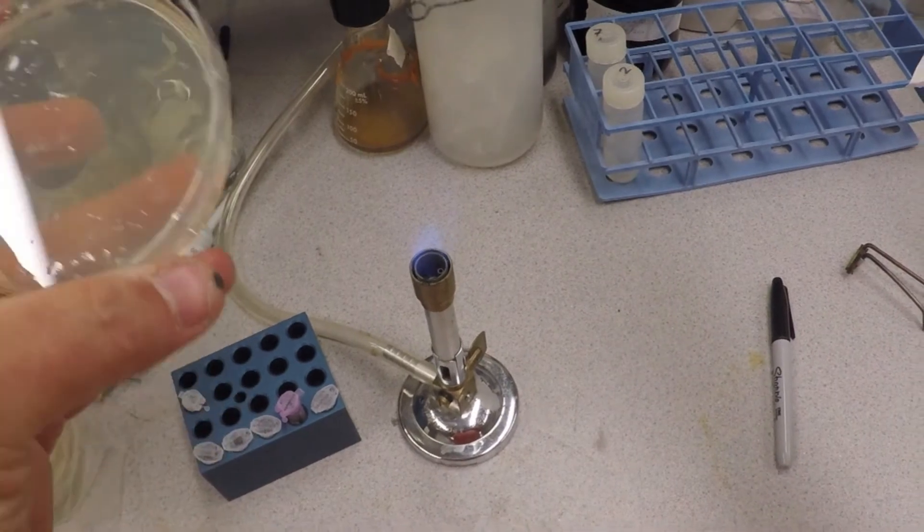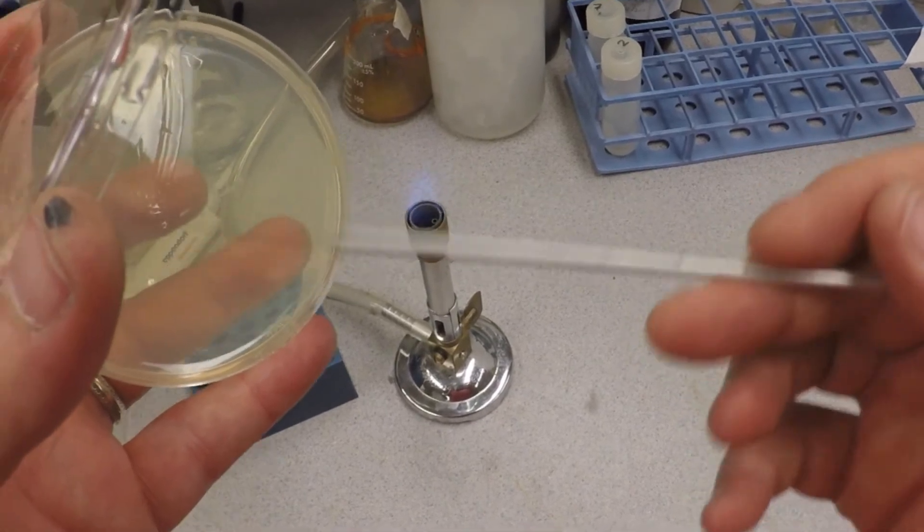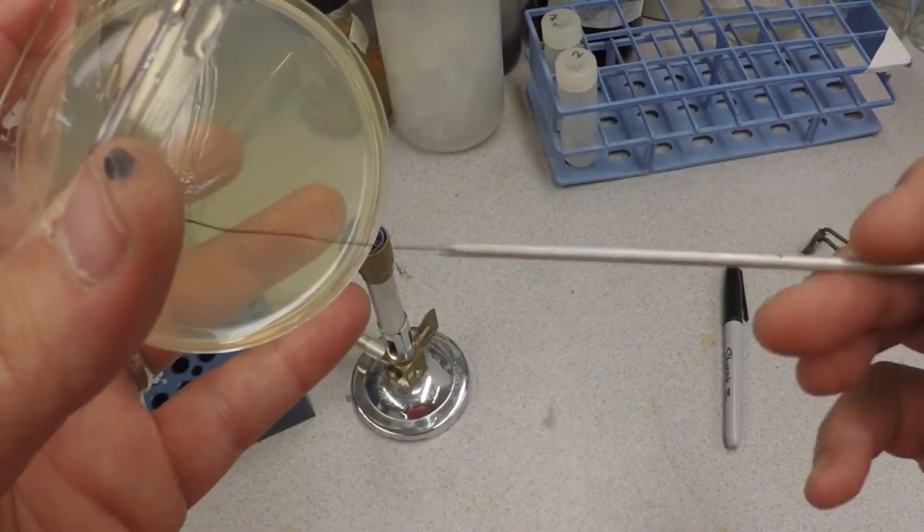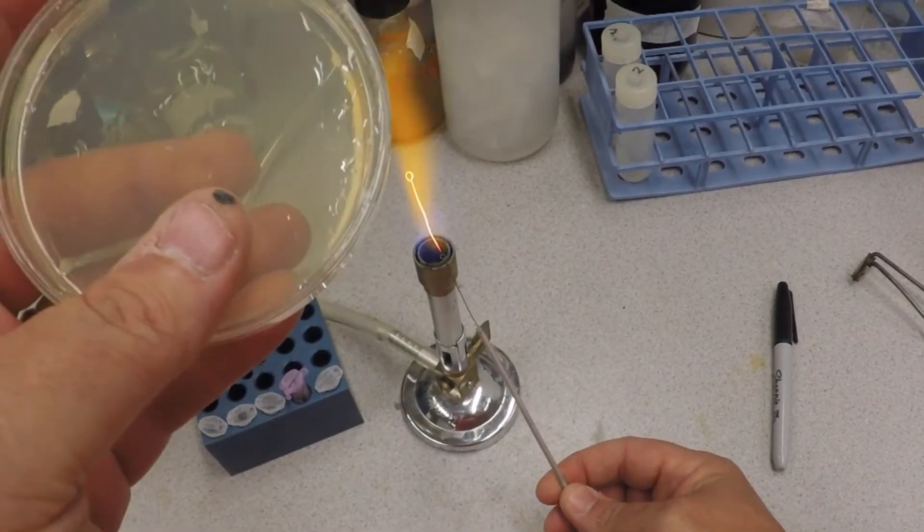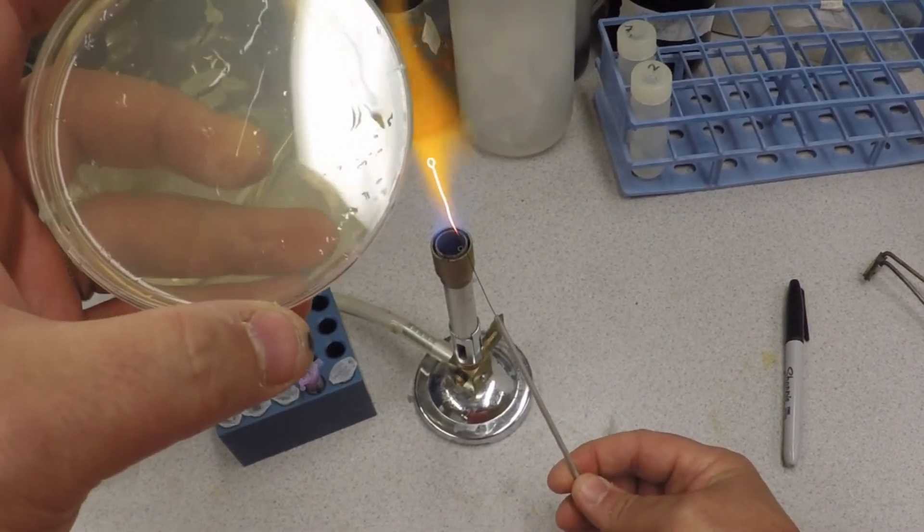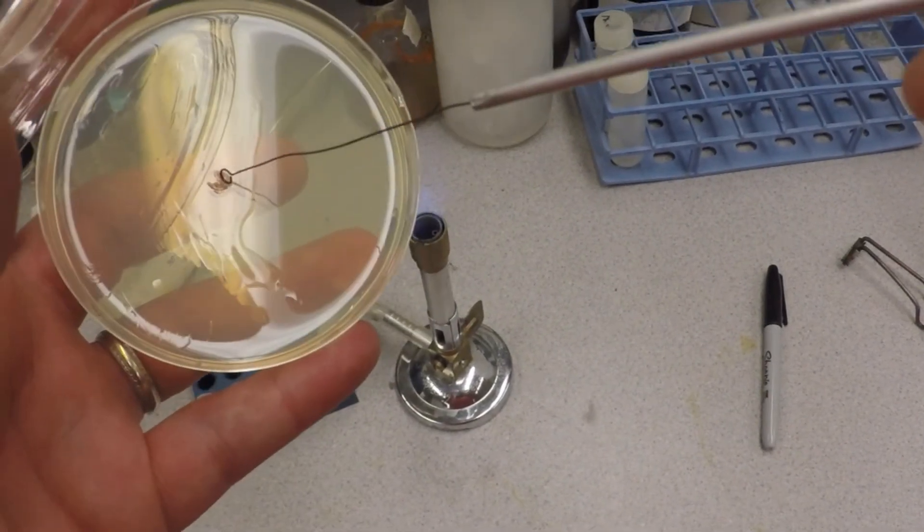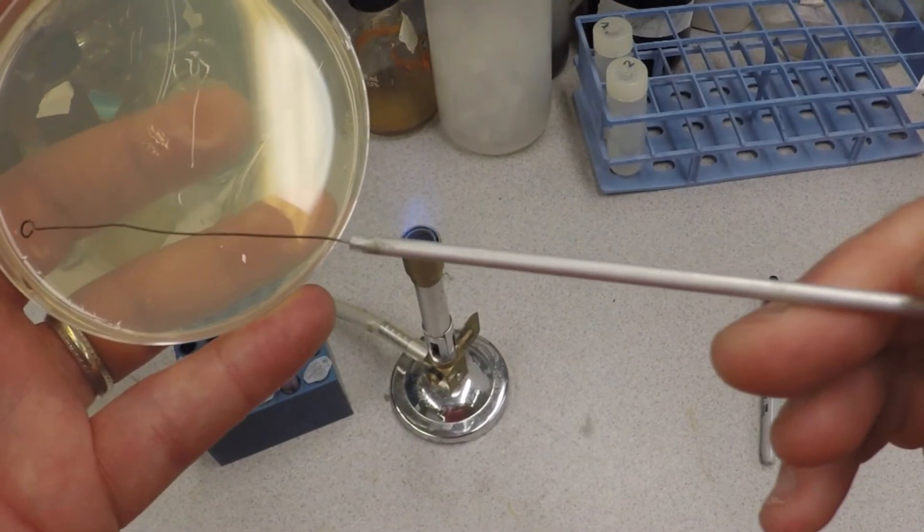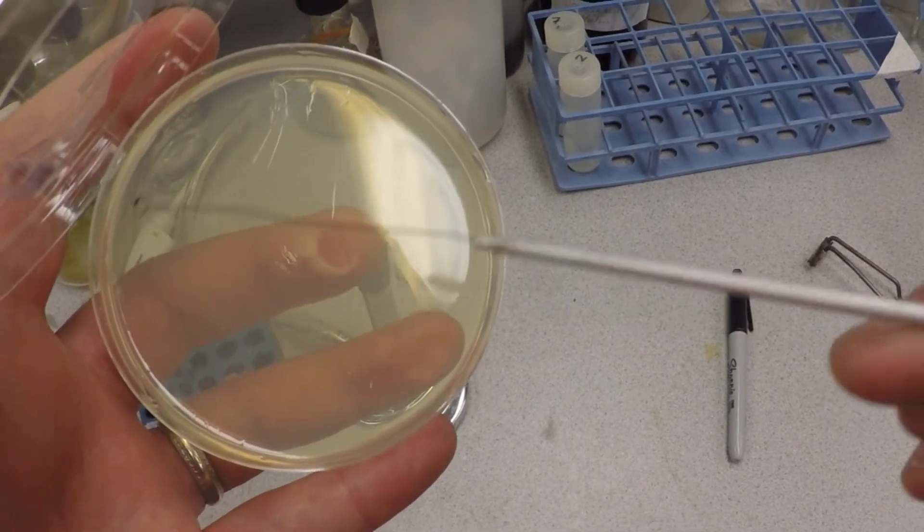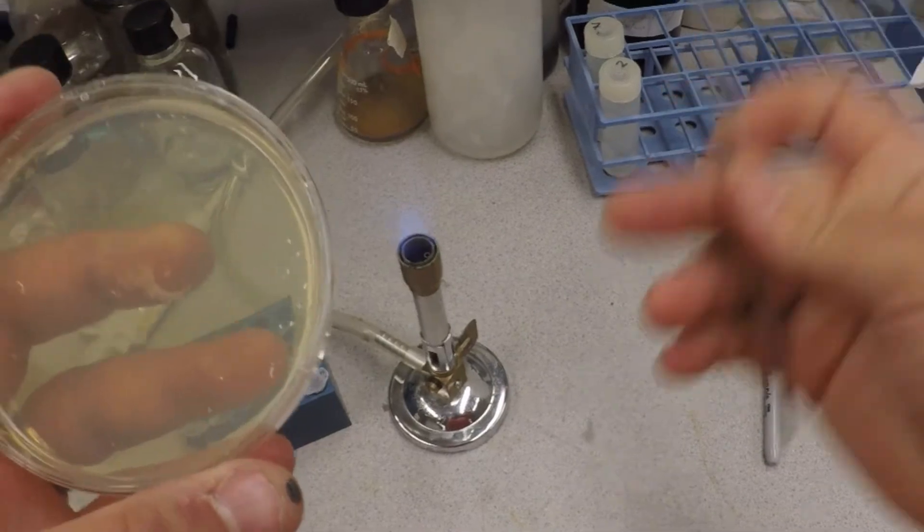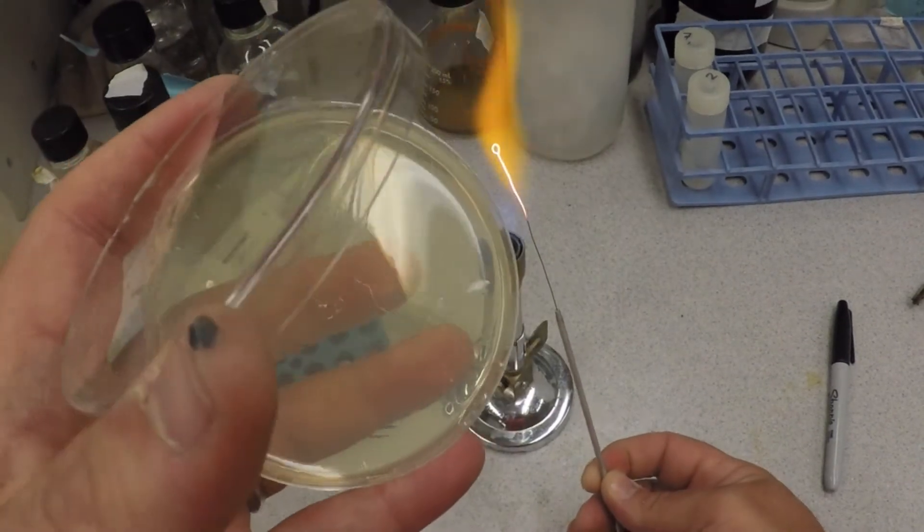To streak a plate, you're going to open the lid carefully, go to one quadrant and go back and forth, streaking it back and forth. Close the lid, flame this. Now you're going to turn the plate a few degrees, and I can see where I've already streaked it on the agar plate. Cool the loop, go in, and this time drag across and lift, drag and lift, drag and lift, drag and lift. Four times maybe. Nuke it again, turn the plate some more.